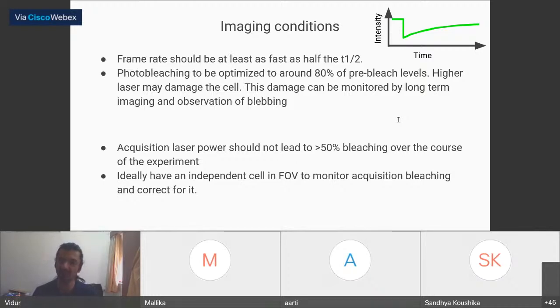The second thing is what people have done is used FCS to study interaction between two proteins which are completely cytosolic and not part of any bigger complex apart from those two proteins, because FCS gives higher resolution at those faster diffusion time scales.